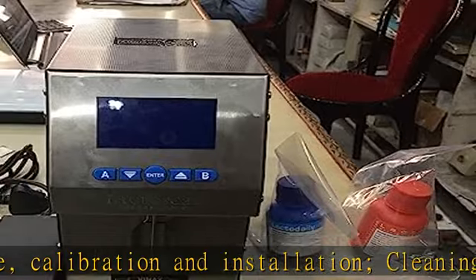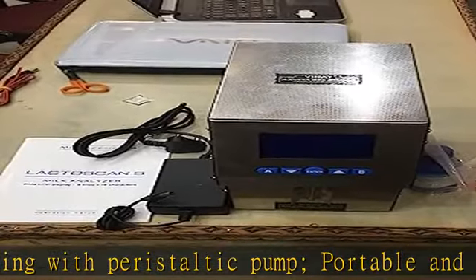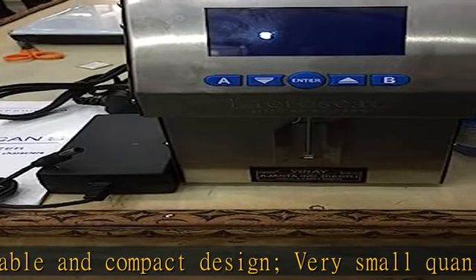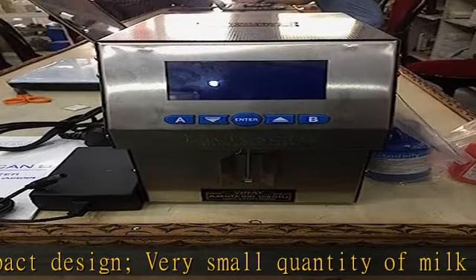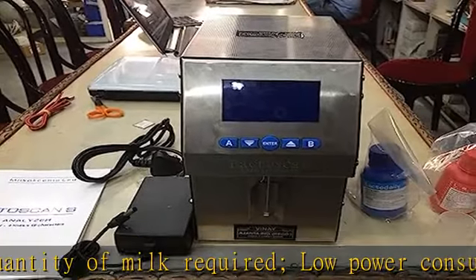Measuring accuracy adjustment can be done by the user. RS232 interface. ESC/POS printer support. Two-sample self-calibration. Easily readable results. Possibility of connecting pH probe. Integrated pH and conductivity measuring. Function real-time clock.